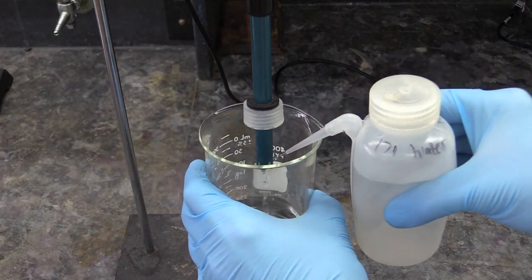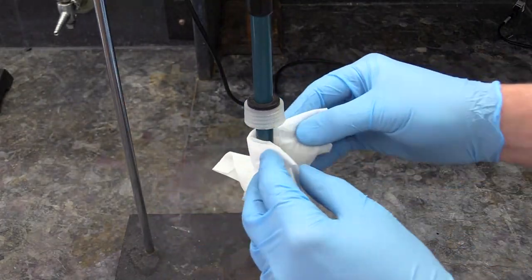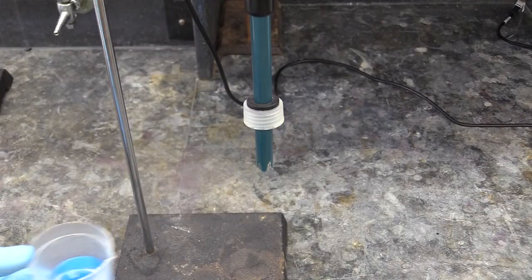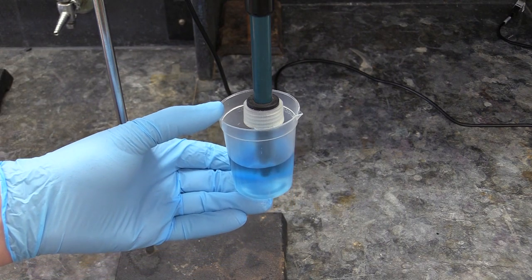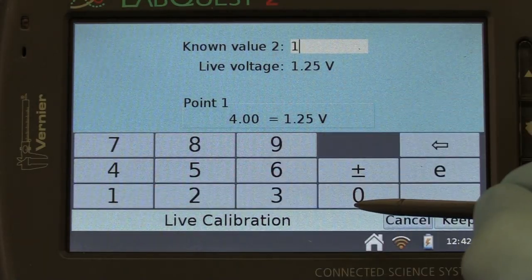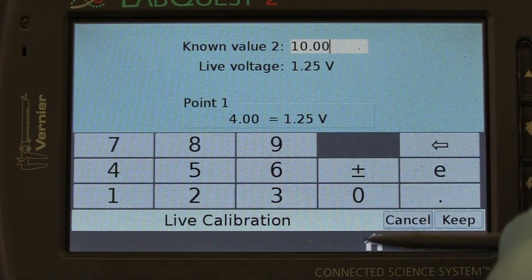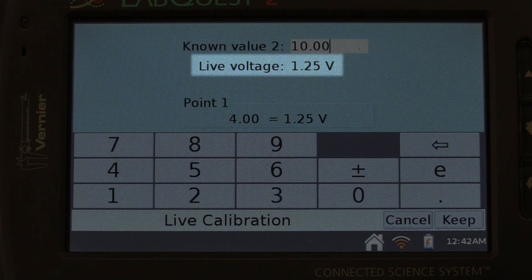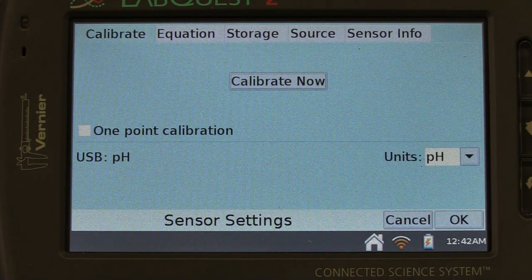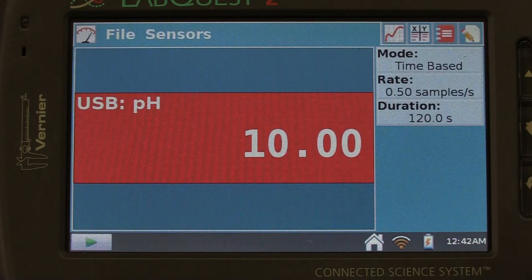Next, rinse the probe off again with more DI water and immerse it in the blue pH 10 buffer. Then enter 10 in the value 2 box, wait for the voltage reading to stabilize, and again press Keep. After that, press OK to return to the main screen.